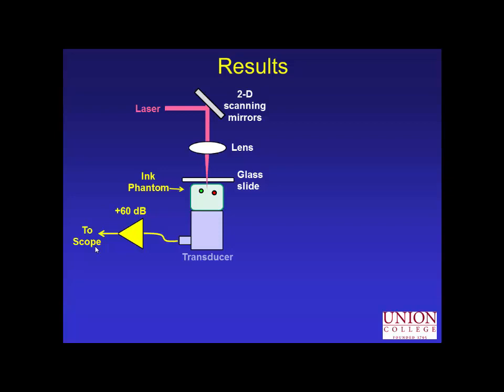As far as an actual photoacoustic experiment, this is the usual optical resolution photoacoustic microscopy system. We have some scanning mirrors and we focus the beam into the sample. In this case, we just have dye-filled tubes, 250 micron inner diameter. And then we have a 25 megahertz transducer for detection and an amplifier. As you scan the laser, you acquire your signals.